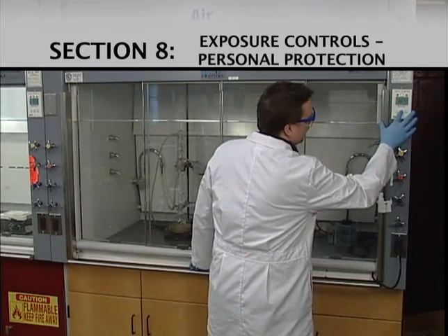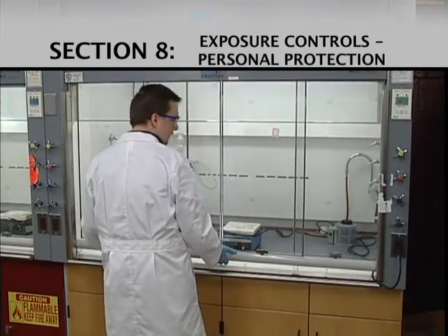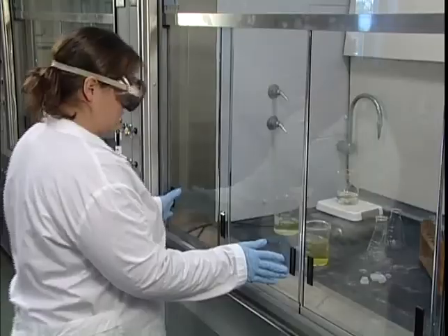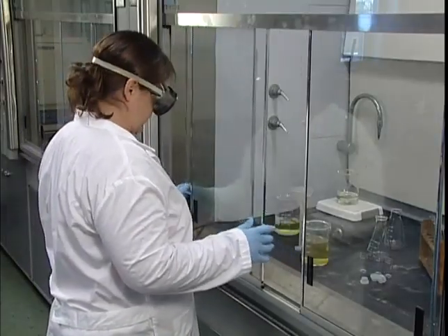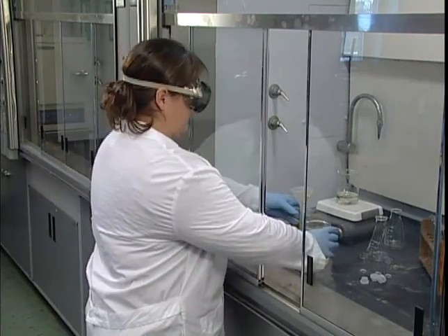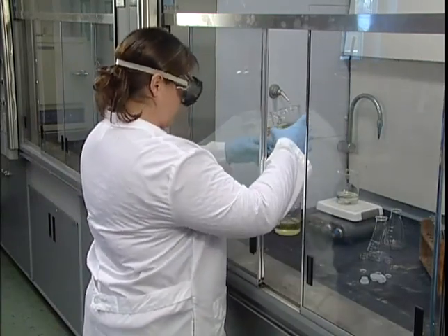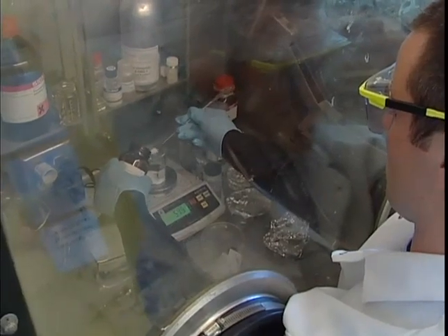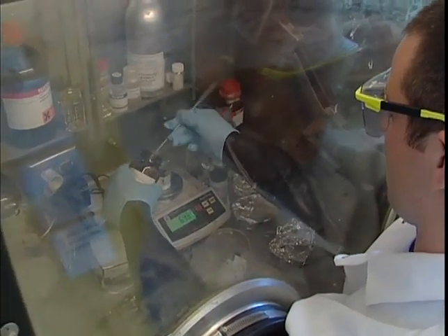Engineering controls, personal protective equipment, and exposure guidelines are addressed in Section 8 of the SDS. Engineering controls might include things such as the use of local exhaust ventilation systems when working with some materials. Other materials may require fully enclosed systems where no release of gases or vapors can be permitted.